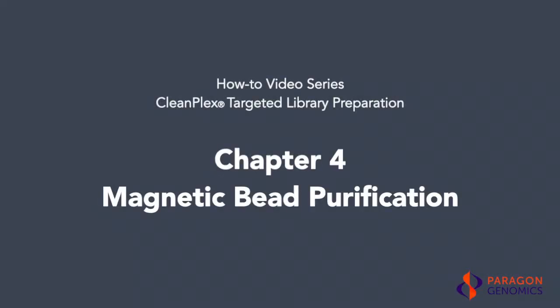The CleanPlex Targeted Library Preparation Protocol consists of three steps, each followed by magnetic bead purification. In this video we will show you step-by-step how to perform magnetic bead purification to remove enzymes and unwanted PCR products using the CleanMag magnetic beads.